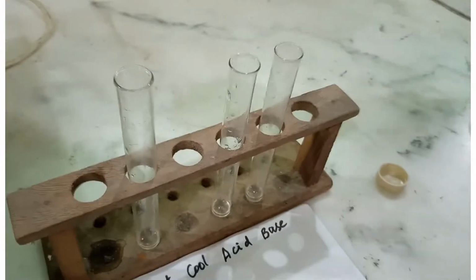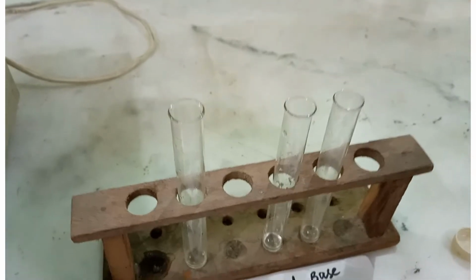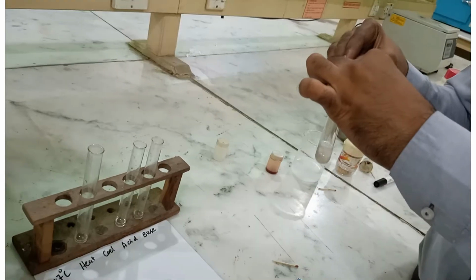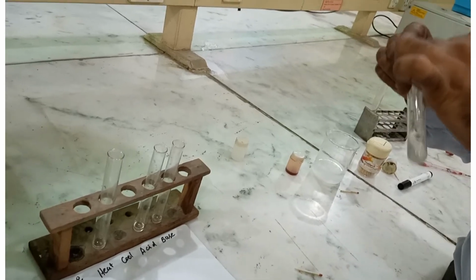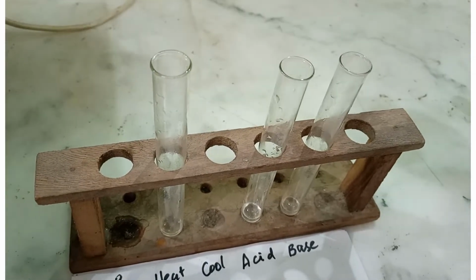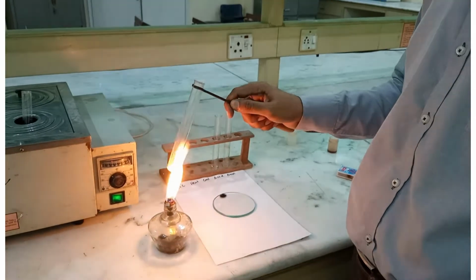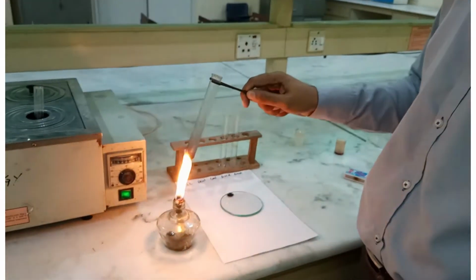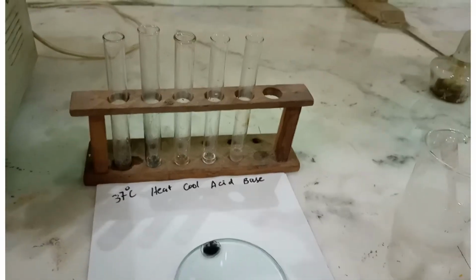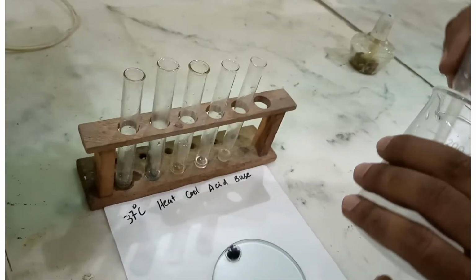Going to add 0.5 ml of acetic acid in the tube nominated for acid, and 0.5 ml of basic solution in the tube nominated for reaction with a base. Second tube on the spirit lamp. After a specific treatment to each test tube, now the test tubes are back upright. Now we are going to put an equal amount of starch solution into all tubes.